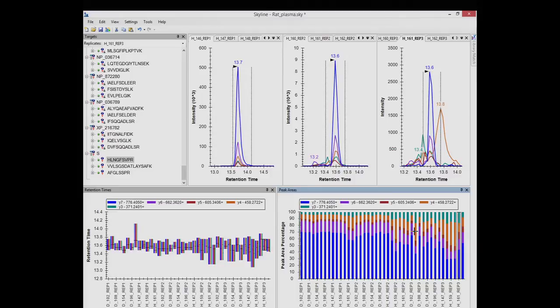So we're seeing this Y4 and it's getting bigger. What does that tell me? Actually, you can see it right here. Signal's going down and there's interference. So we're getting more variability because signal's going down. You can guess these things before we look at this by removing the normalization. I've seen this kind of pattern a bunch, and it usually means that signal of my peptide's going down and there's interference from another peptide taking over.